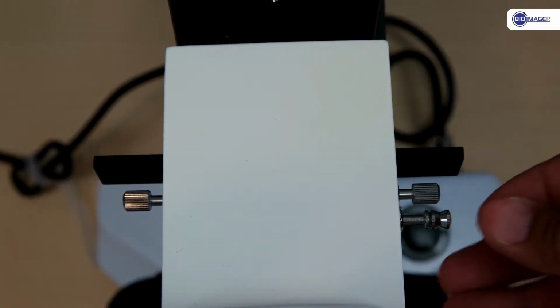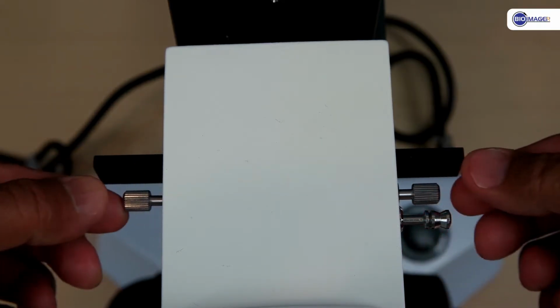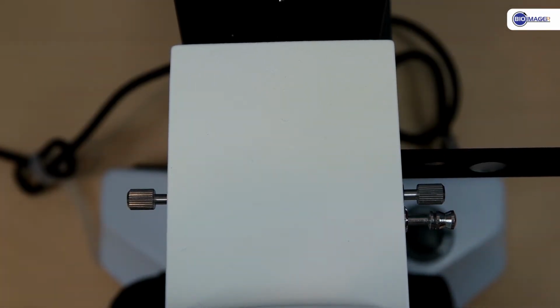This attachment comes with an iris diaphragm. You can open or close it and also align its location by using these 2 screws. It comes with a slider. You can put a diffuser or special filter and also use it as a shutter to block the light.